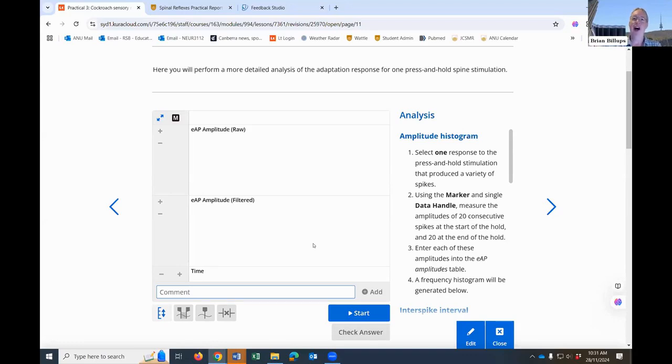Our class size varies, but our maximum is 80. So then you've got 4 people to a group. Sometimes it's 2 to a group. We let them self-select their groups. If our class size goes much higher, and it will in coming years because of changes in our program, then we're going to have to run it twice, because we don't have enough PowerLabs and computers. A group of 4 isn't ideal. A group of 2 or 3 is better.